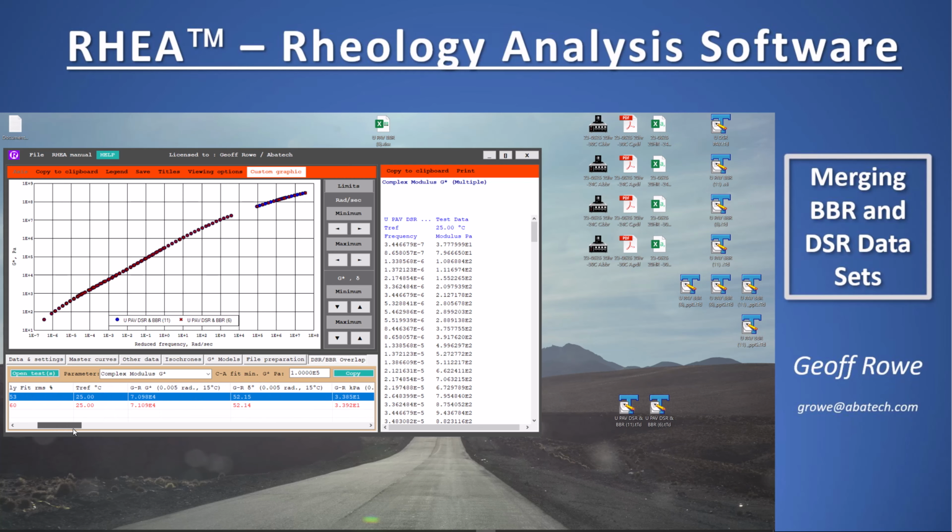And then we can start to look at some of these results. If you look at some of these results like the Glover-Rowe number, you can see they're very similar. If we come along to the work that Pavel Kriz did, where we look at the phase angle at constant modulus, we've got 37.96 versus 37.94. They're virtually the same number, which is what we expect. Let's come along to the end here, where we have the R value: 3.39 versus 3.38. That's using a 1e to the 5 limit.